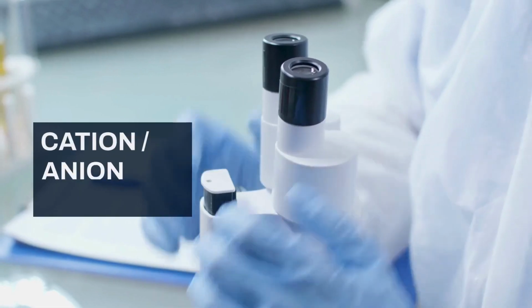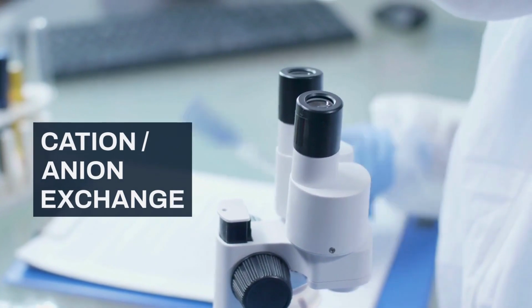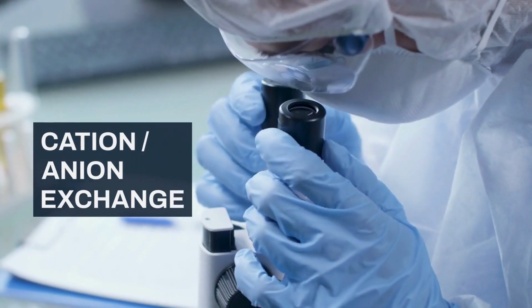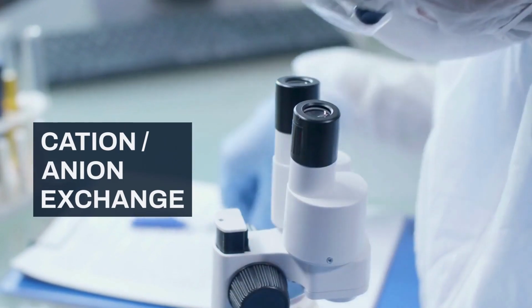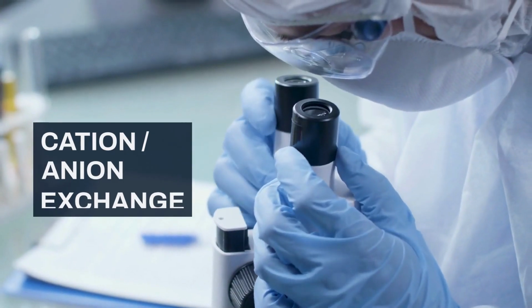If you are using a cation exchange column, positively charged molecules bind, and the most positively charged ones elute last. If it's an anion exchange column, negatively charged molecules bind, and the most negatively charged ones elute last.